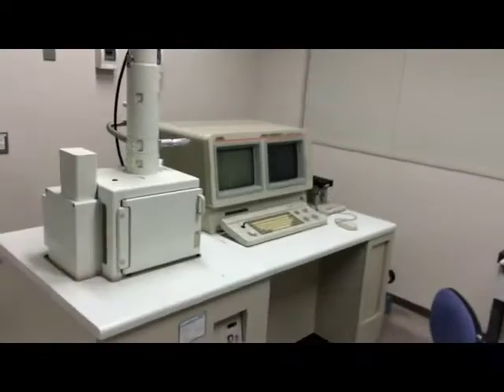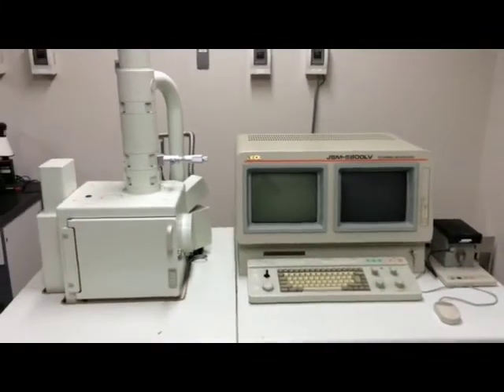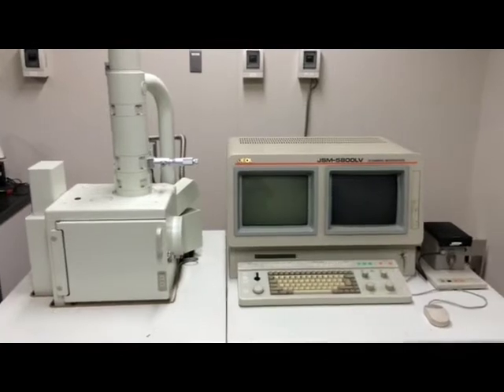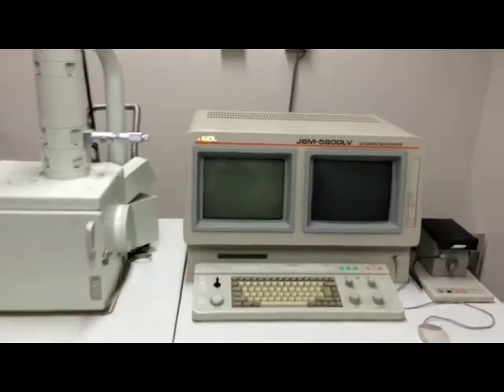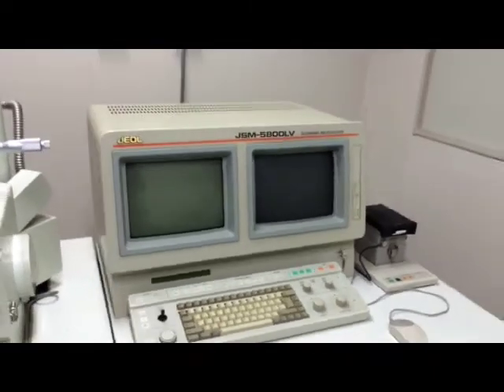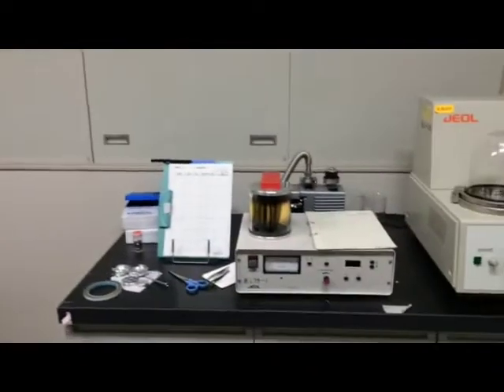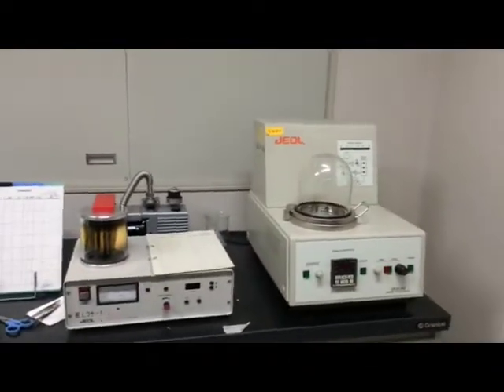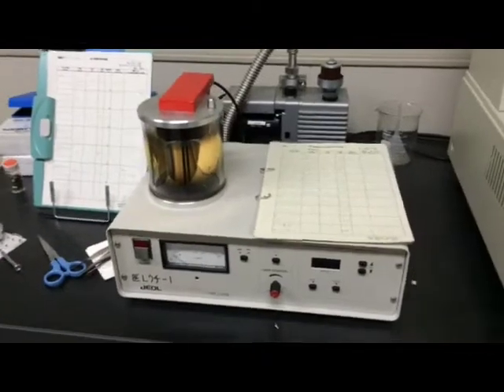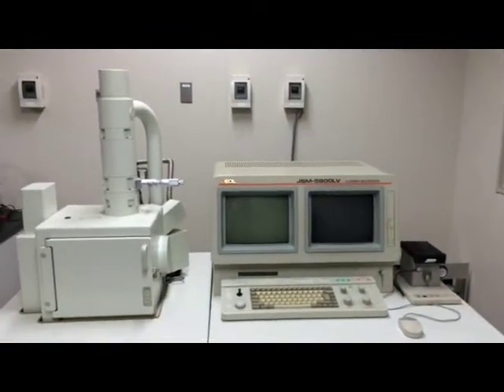I would like to share about how to use this scanning electron microscope, JSM-5800LV. And this is another instrument for gold coating.